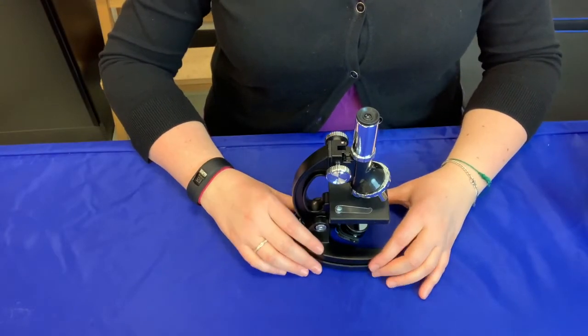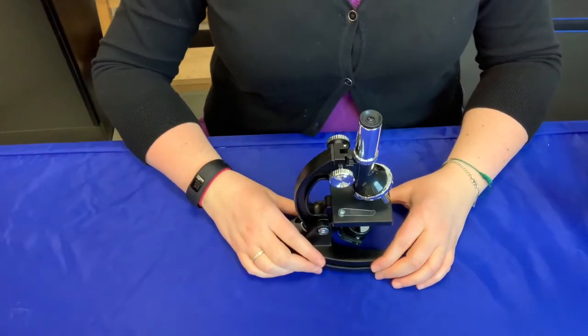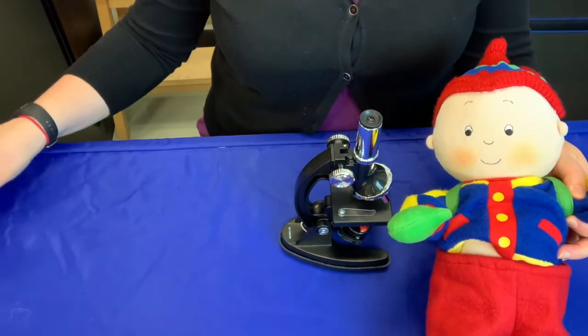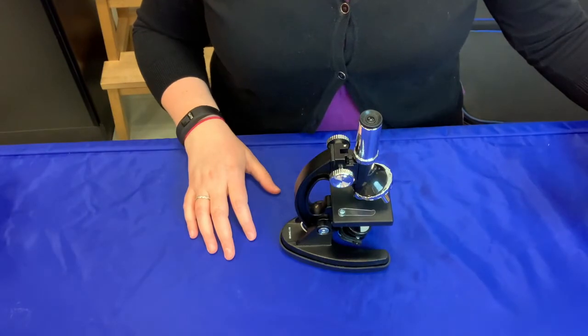Today we're going to start with some safety tips when using the microscope. First, keep small children and animals away from any samples or experiments you might be working on.